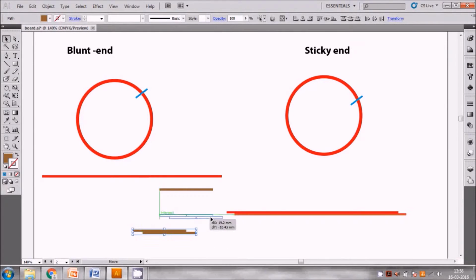If you want to attach to this, you can see that it is not very flexible. It is rigid, it will stick here, and then it will try to find the place to attach, and it is easier to attach any DNA molecule in a sticky end pattern.